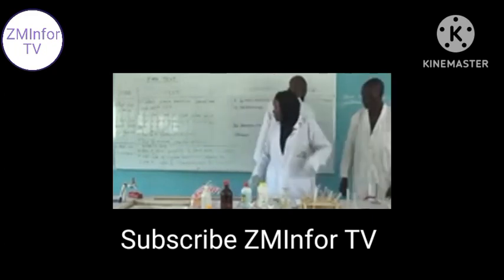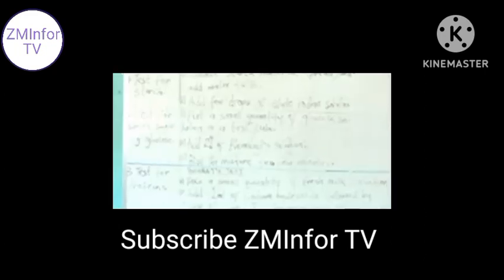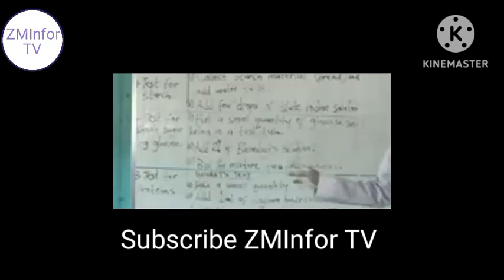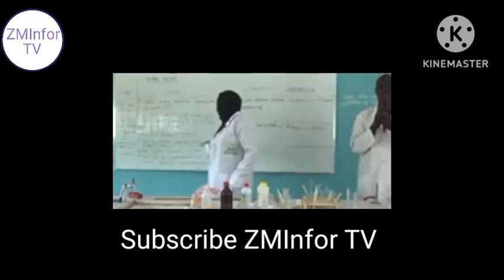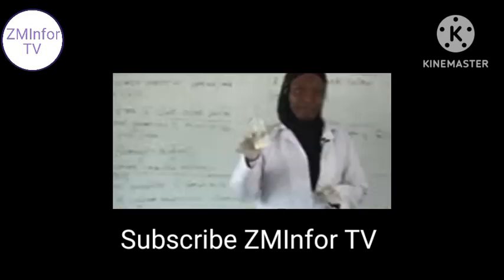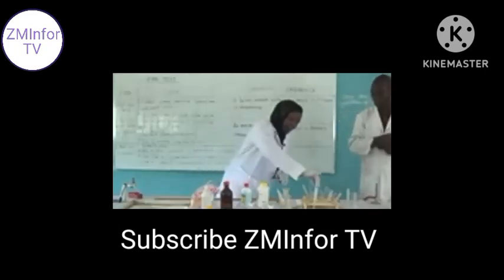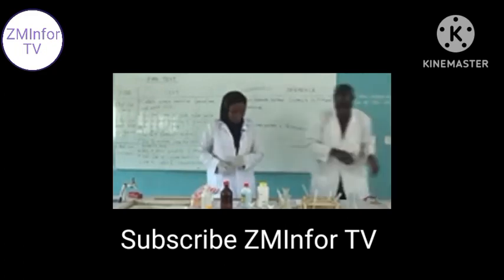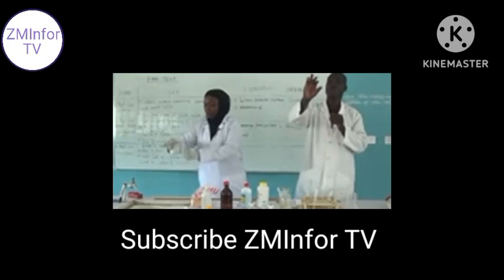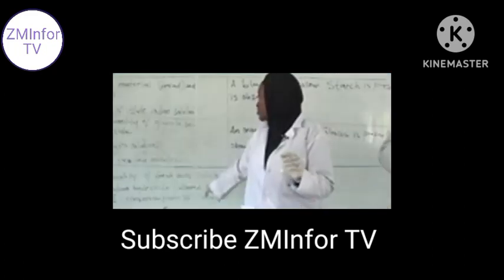Test for proteins. We'll go for the Biuret test. We're supposed to take a small quantity of fresh milk solution. We have it already in the beaker. We take small quantity of it. We have to take a small quantity of fresh milk solution.